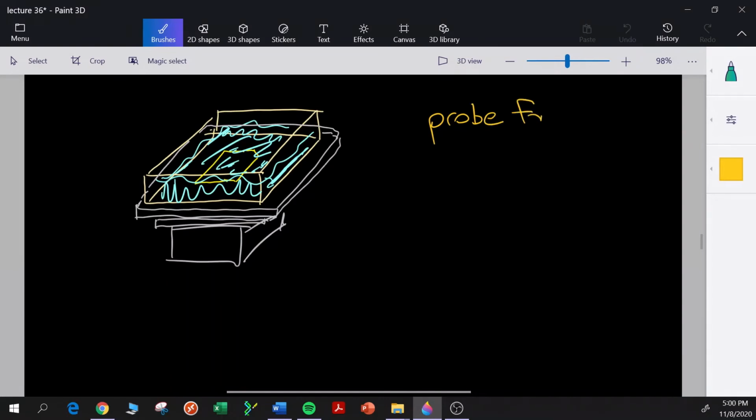We say this is the probe for CSA, the single-stranded radioactive probe. We'll add that, and then we can shake it overnight, usually at a certain temperature that promotes hybridization to the CSA messenger RNA without non-specific hybridization to, let's say, messenger RNAs that it might be partially complementary to. So we give it time to find the messenger RNAs on the nylon membrane.